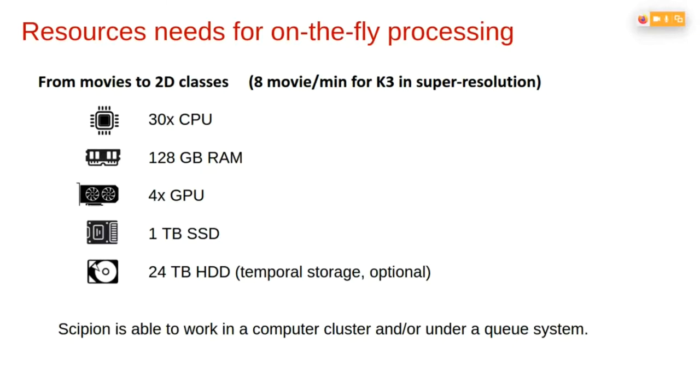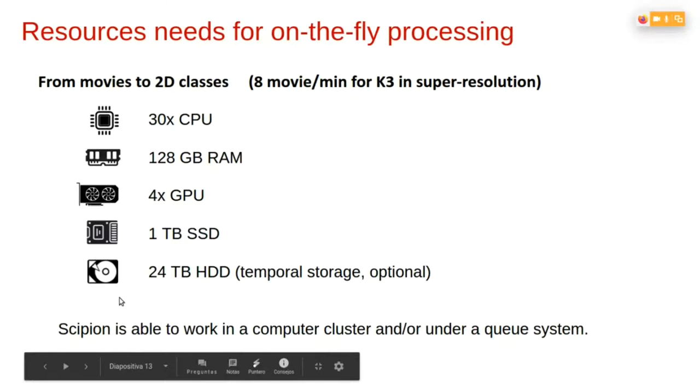It's important to note also that Scipion is able to work in computer clusters and under a queue system. So if this is your situation, please don't hesitate to contact us in order to fit Scipion to your system configuration.